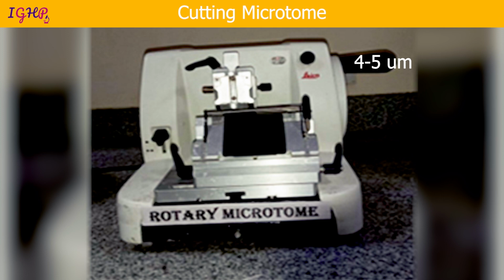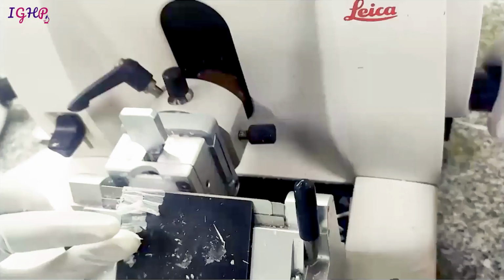The normal section thickness that should be cut in the microtome is around 4 to 5 microns. So that is very important. If you take thick sections, then you will not be able to decipher the cellular details properly. And if you are doing specialized reporting, like for liver or kidney, then you need to cut at an even lower micron, 3 to 4 micron also. So that is your rotary microtome.